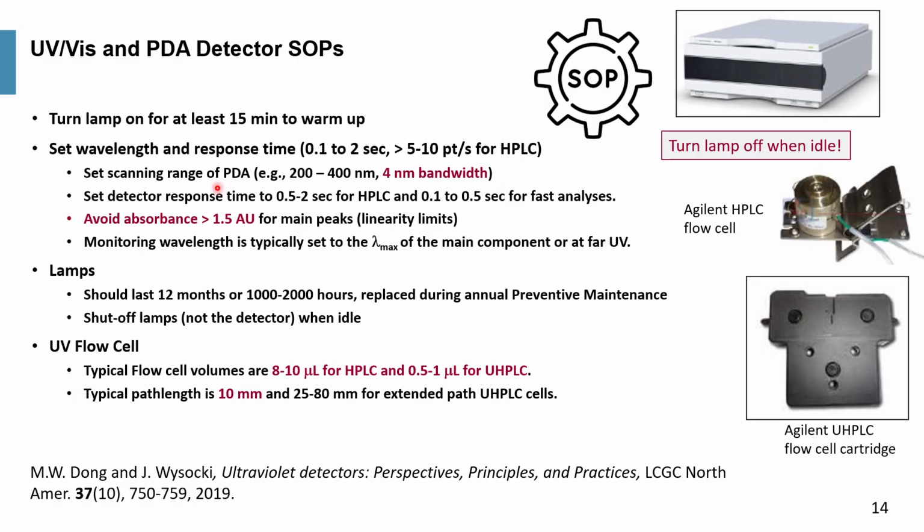Some of the photodiode detector PDA allow you to change the bandwidth, or allow you to bunch it. So the best standard spectral bandwidth is about 4 nanometer. Some of the Agilent allow you to tune down the slit width to give you a better spectral resolution. However, at 1 nanometer slit width, things are much more noisier, so it's really not recommended.